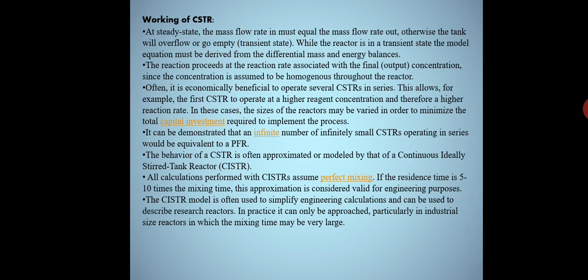In this continuously nutrients are being added and there is formation of the product. यहाँ पर steady state maintain की गई है between the reactants and the product. So yes, this is just the overall mechanism and working of CSTR की nutrients add किए जाते हैं, and from the inlet nutrients are being added and from the outlet the product is been removed, and after that the downstream processing is been done.